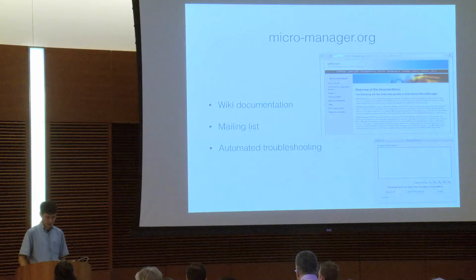And this has really helped us. So what it does is if you start it and then do some steps that have issues maybe in hardware control, it captures all the communication with the hardware and other things that happen in µManager and allows us to debug device issues, even for devices we've never seen. So that's an interesting facility we have built in.